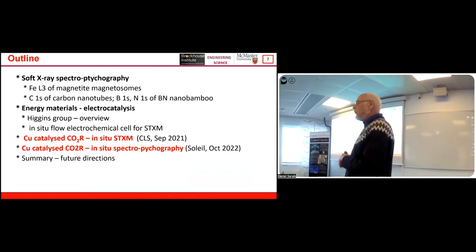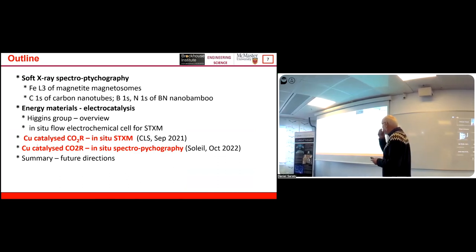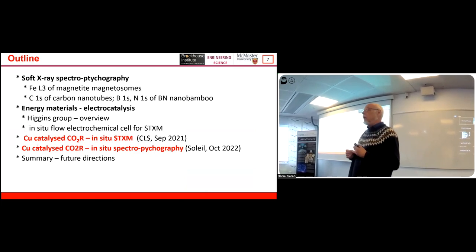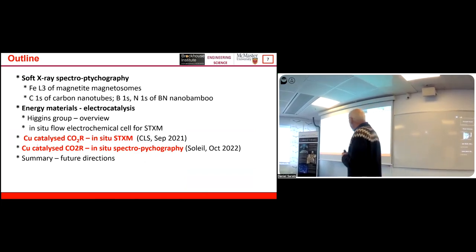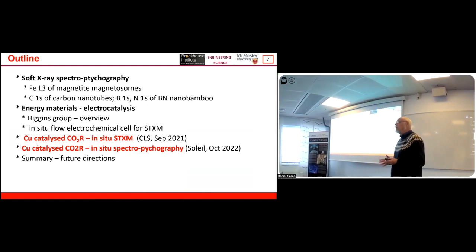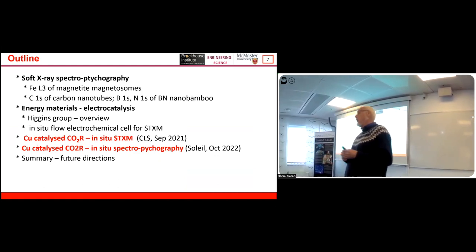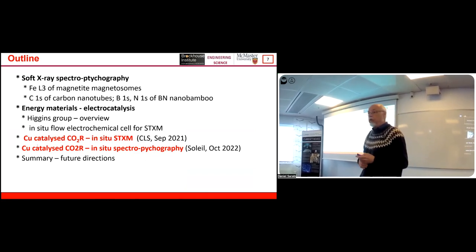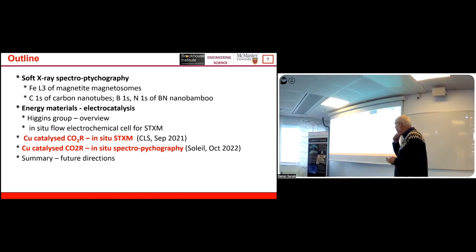And so what I'm going to tell you a bit about is some of my work in soft X-ray spectro-ptychography, two different areas: a biological example where bacteria, which have little magnets in them, are being studied, and a second one in a collaboration with people at Soleil, where we're pushing the photon energy range where you can do ptychography well down below 500 eV, which is the traditional lower limit for people using CCD X-ray cameras. So I'll talk a little bit about that there.